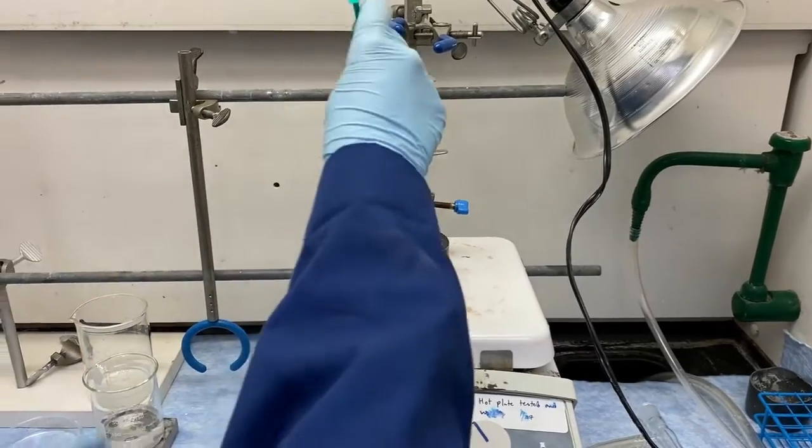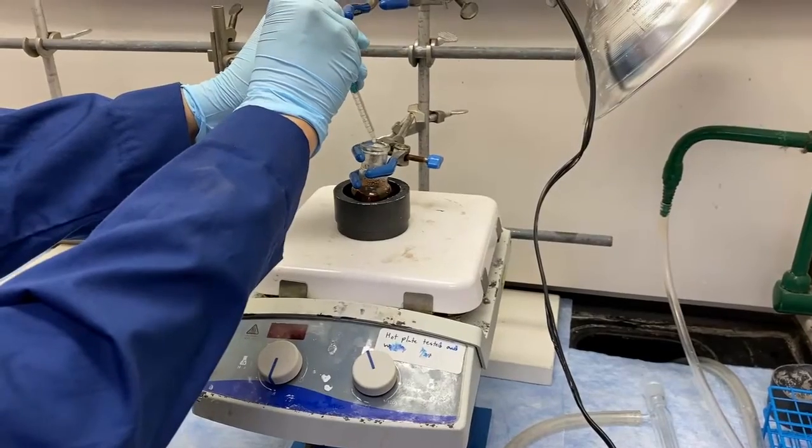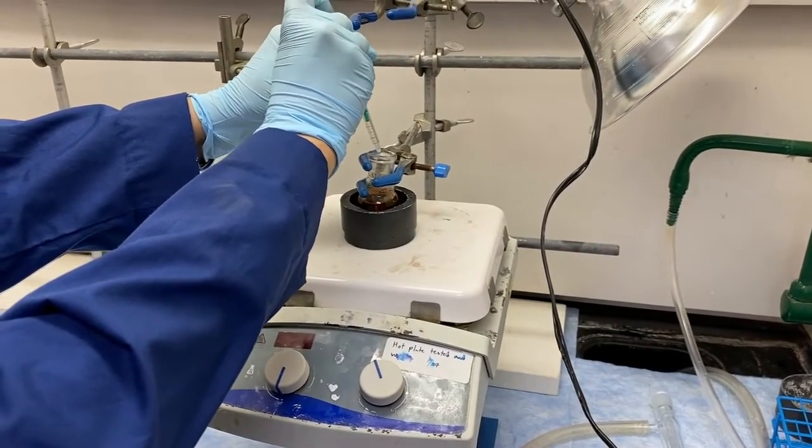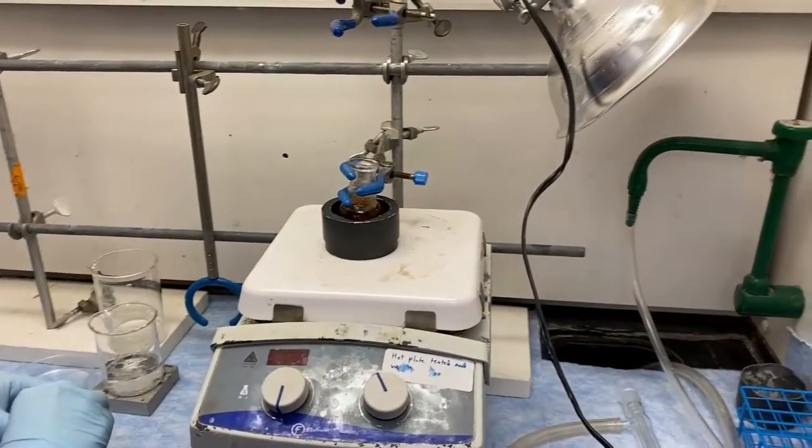This is for the acylation part. After that, we're gonna heat it to a gentle reflux for about 10 minutes, okay? And so this will be the acylation part of the reaction. And so this is the final step of the chemical reaction.